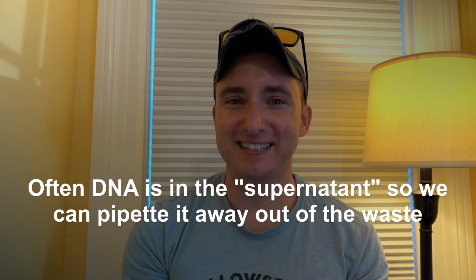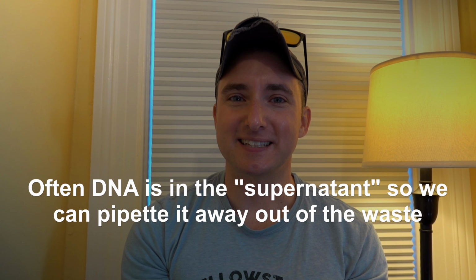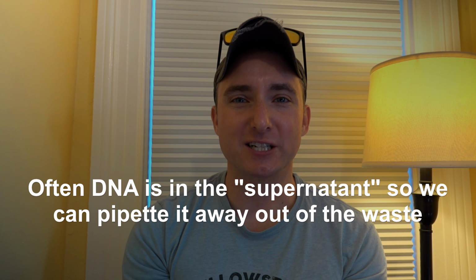There are other times where you need to manually separate your DNA from the waste by pipetting the DNA. This is the most critical step in any DNA extraction, and it's the one that I see people mess up far too frequently. When you're asked to pipette the supernatant, that's telling you that the DNA is in the supernatant and your waste is in the junk at the bottom of the tube.